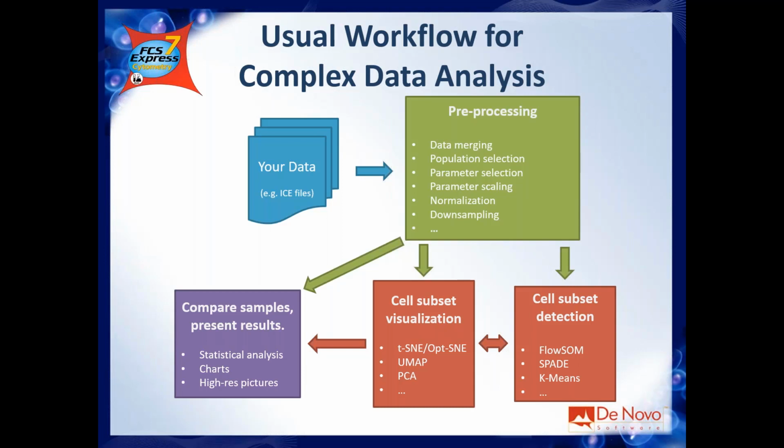Downsampling I've listed here, but usually it's not going to be used like downsampling in flow cytometry, because first of all, in imaging you usually have fewer data points than in flow, but especially you don't want to downsample, probably because you want to have access to every cell in the picture. You don't really want to have any hole in the picture.